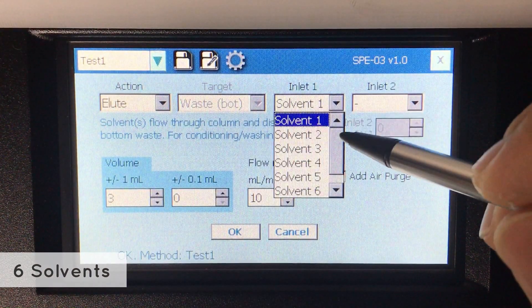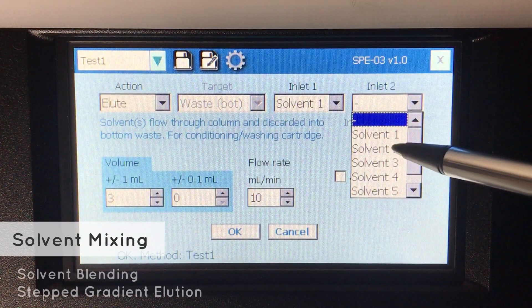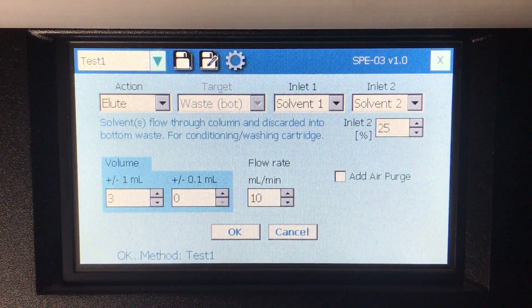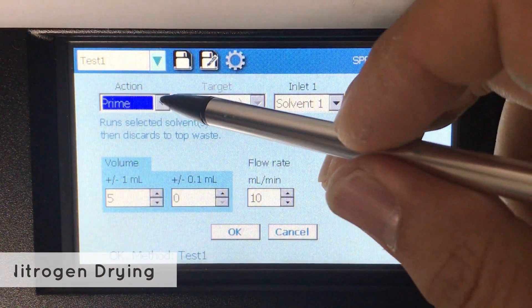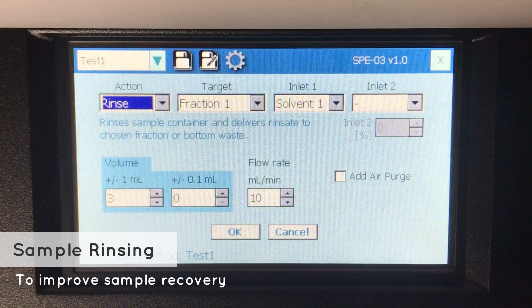Choose from six different solvents for your methods. Solvents can also be mixed at a specified ratio for solvent blending and stepped gradient elution. Other functions include nitrogen drying of cartridges and sample container rinsing to improve sample recovery.